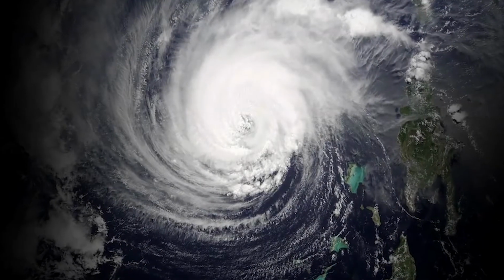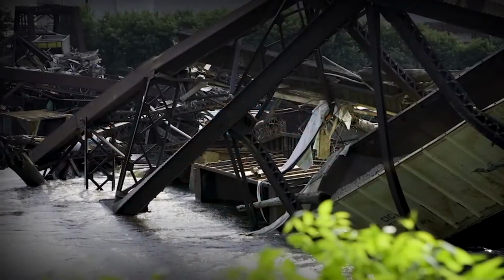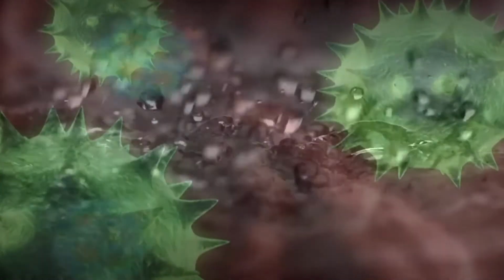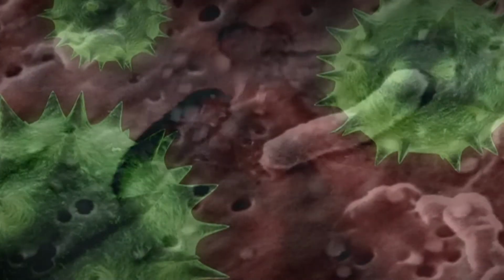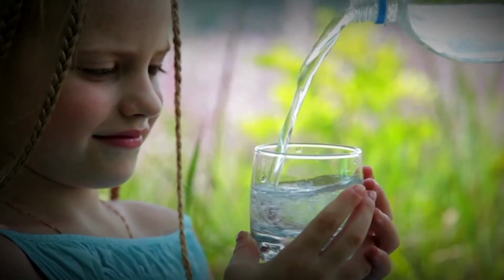During or after a natural, intentional, or unintentional water contamination incident, it may be difficult to analyze drinking water supplies for pathogenic viruses, bacteria, and protozoa. Some of these microorganisms can create a significant risk to public health.